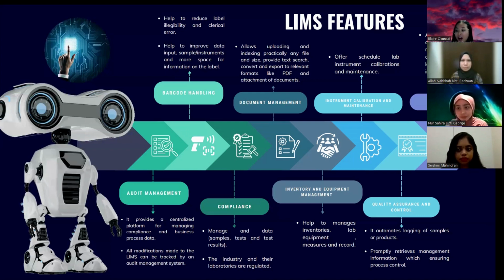in the workplace, and also helps to improve data input and leaves more space for information on the labels themselves. And the third one is compliance, which helps to manage the data of the sample, test, and result, where compliance between the industry and the laboratories is also regulated.